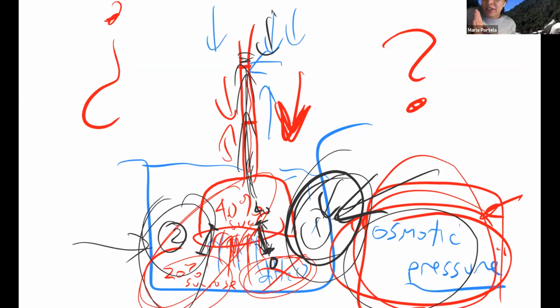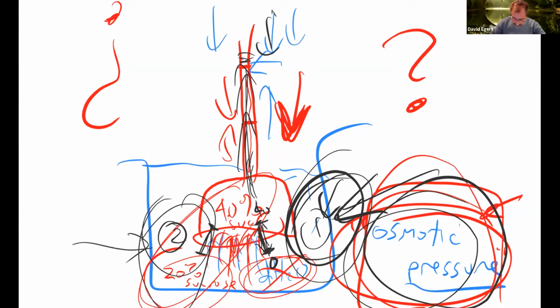Professor, the pressure that the water in the tube makes against the osmotic pressure is the hydrostatic pressure? Yes, basically the water pressure pushing down. Okay, so osmotic pressure is pushing up then. I thought it was gravity. I mean, the hydrostatic head is due to gravity. It's due to the weight of the water pushing back down the tube. But then I thought you said osmotic pressure is gravity pushing down? No. Osmotic pressure is the pressure due to osmosis going up.